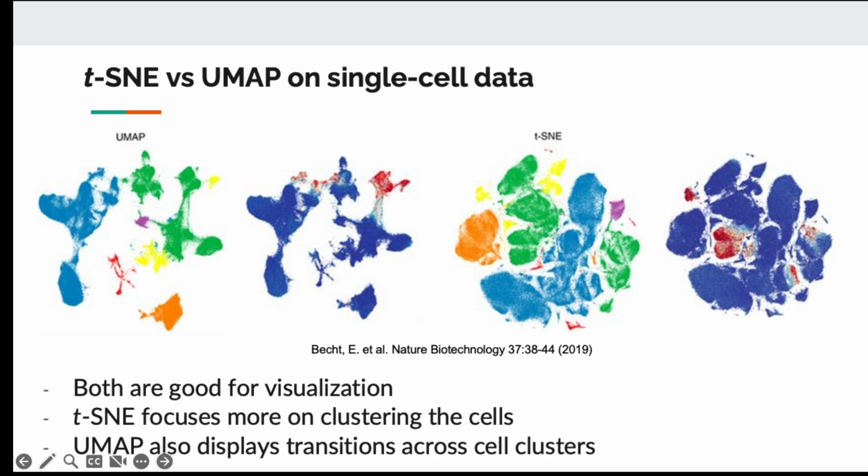If you compare the techniques from this visualization, you can see that in tSNE, most of the cell types are quite rounded, compared to UMAP, where you can have rounded clusters, more scattered clusters, or a path between multiple clusters. So these two techniques operate on slightly different assumptions. With tSNE, the goal of the technique is to show you the clusters of the cells. So you're going to get all the cells clumped in rounded clusters, and it's easy to see the clusters.